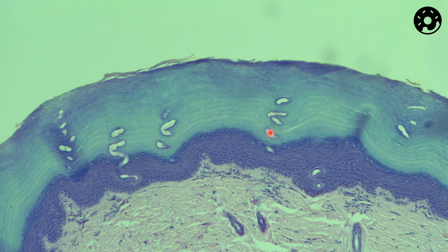Now you might be wondering, what are these little holes right here? And these holes are actually these excretory ducts of the sweat gland. So it's how it's releasing the sweat to go towards the surface. So we can see them all over. So this person must have been sweating.